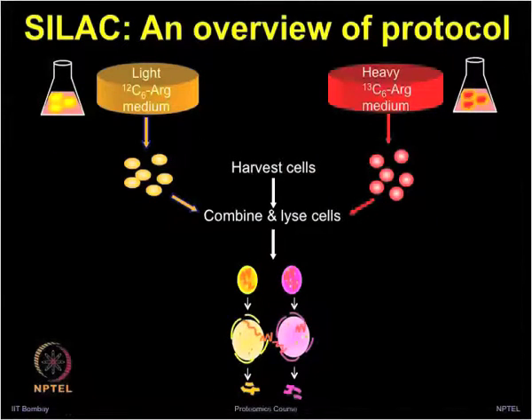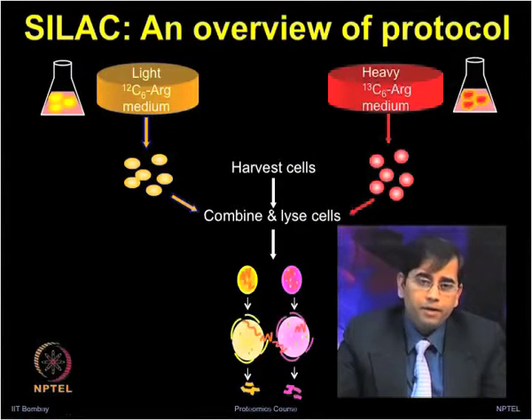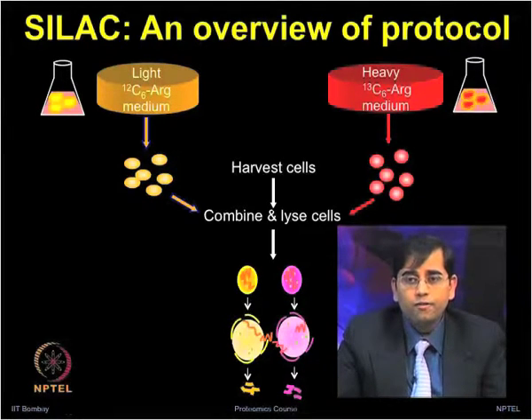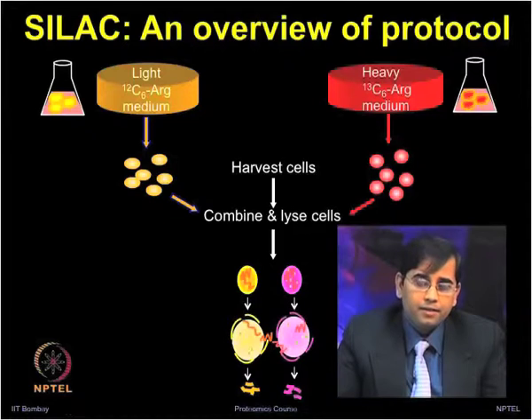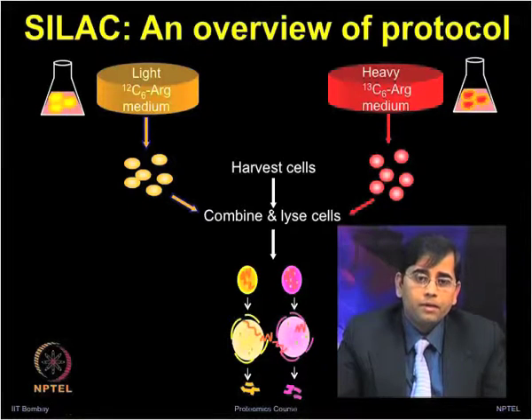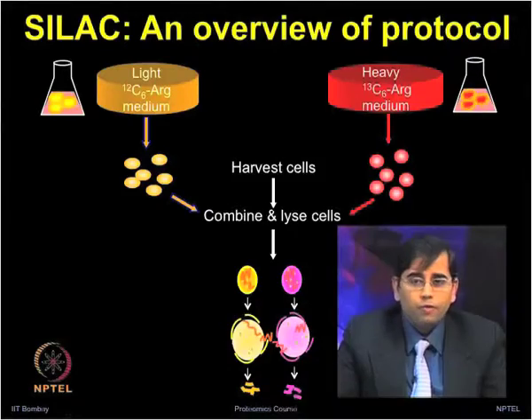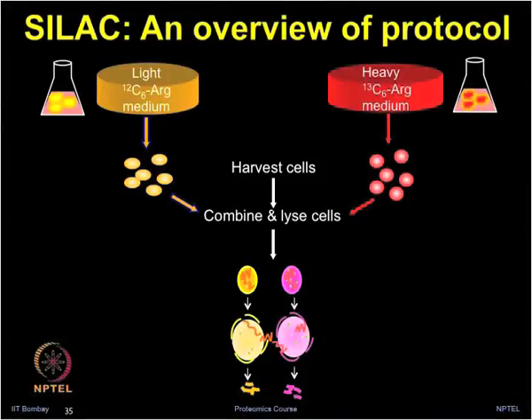So, in SILAC, two different cell populations can be grown in DMEM media containing 13C6 stable labeled form of arginine in place of normal or light arginine. After allowing for 5 or 6 doublings, in each protein the arginine is the heavy form now. These cells can be combined and further lysed prior to further proteolytic steps.